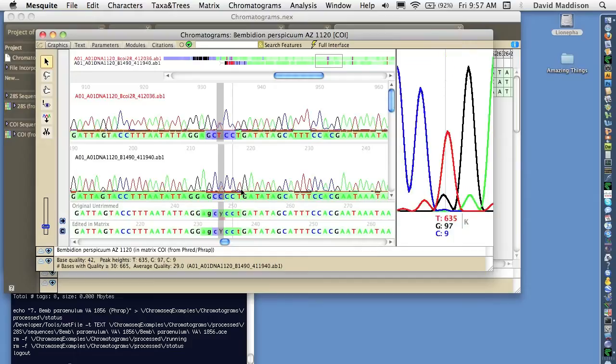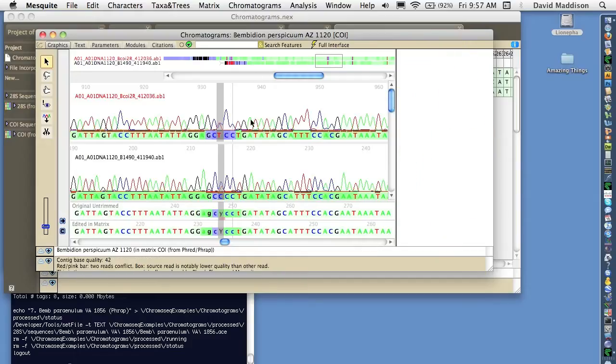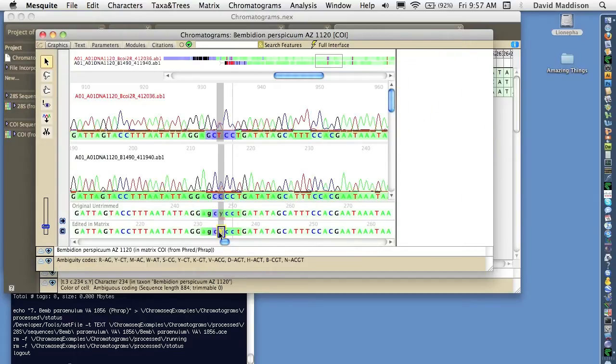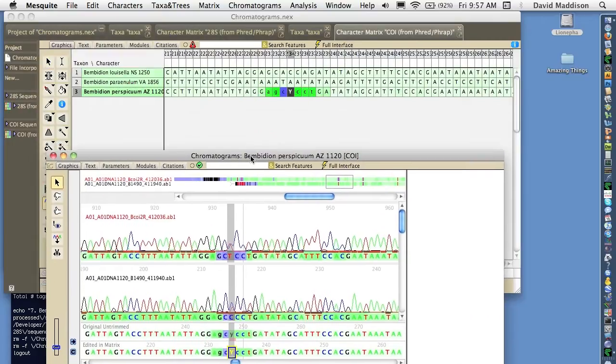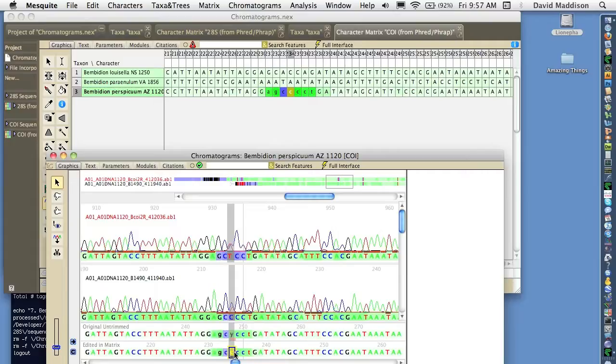We could change a base call. So for example, not that we necessarily would want to, but let's change this Y here. And we can see that there's the Y in the matrix right there. We can change this Y to a C. And we now see that in the matrix itself that's changed to a C.